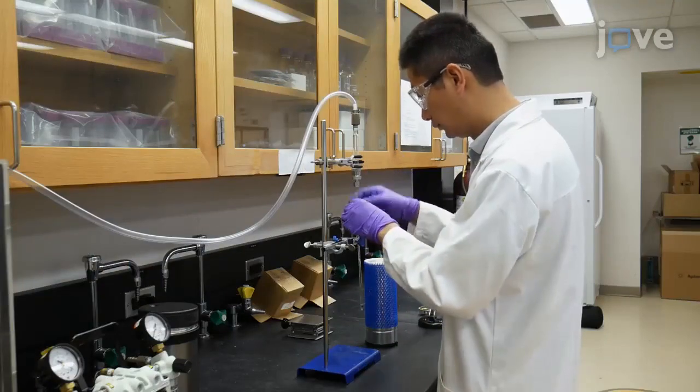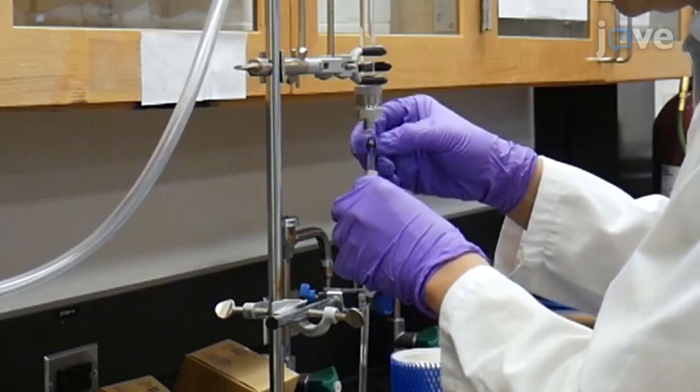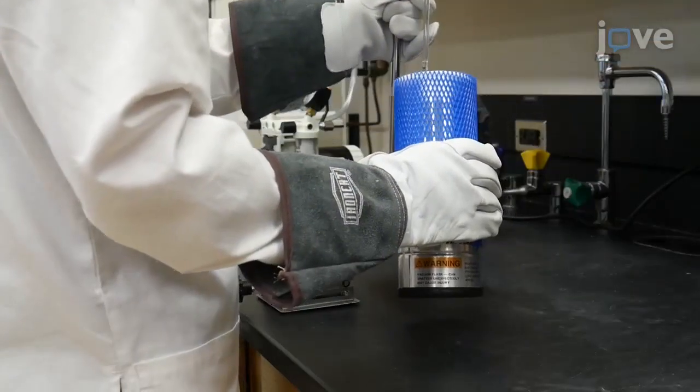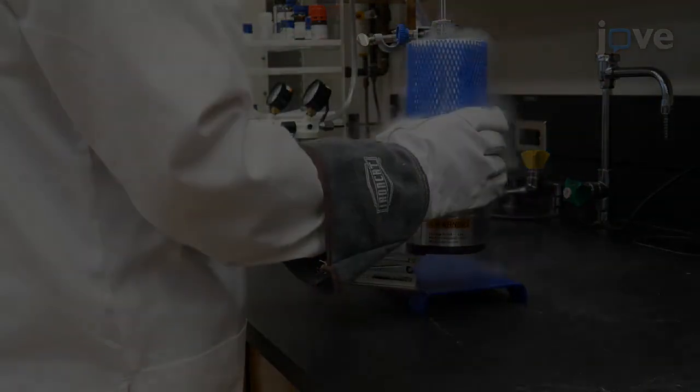Connect the tube to a vacuum line with a close valve. Use a clamp to tightly hold the tube, and immerse it in a Dewar flask filled with liquid nitrogen. Leave the tube in the liquid nitrogen.